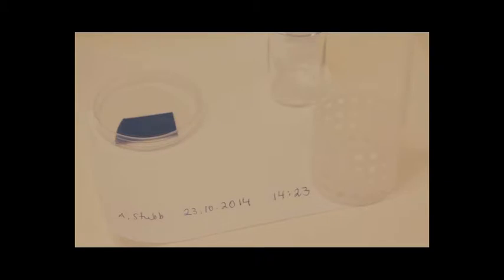Mark your things with a note containing your name, phone number, time and date. Remember that your beakers must have labels showing the contents.